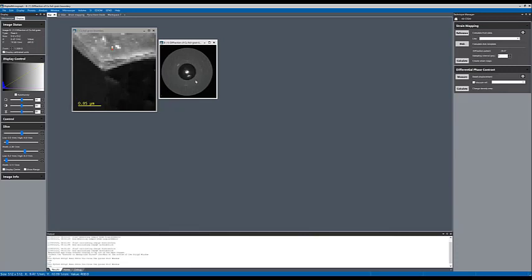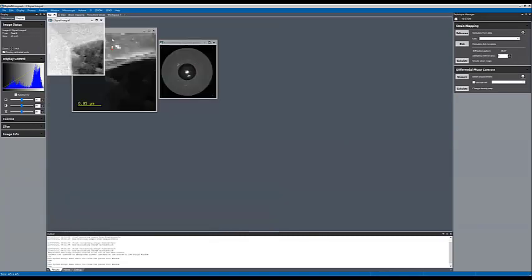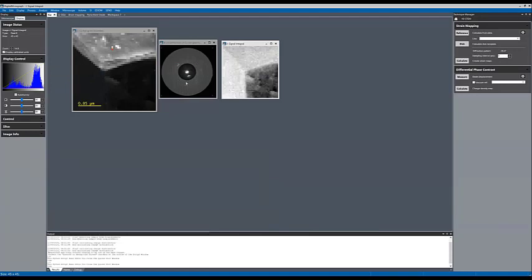So once you've adjusted your angle, you do the same thing. You go to SI, map, and signal. And now I have an annular, a virtual image from a virtual annular detector. And what DM does is it goes pixel by pixel in each of the diffraction patterns and sums the signal in the region selected by this bandpass. So that's how you generate your signal.